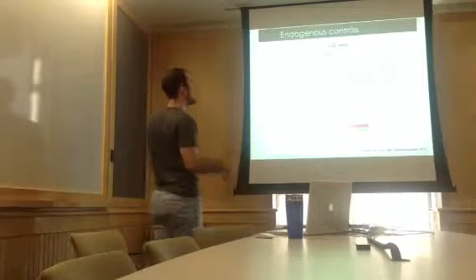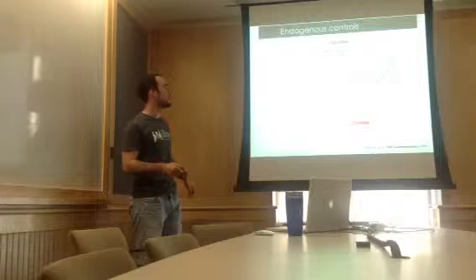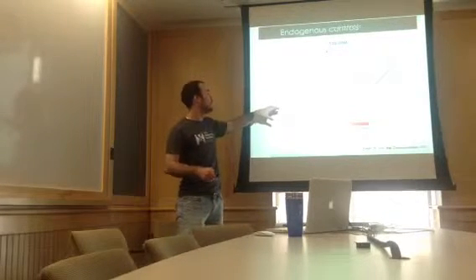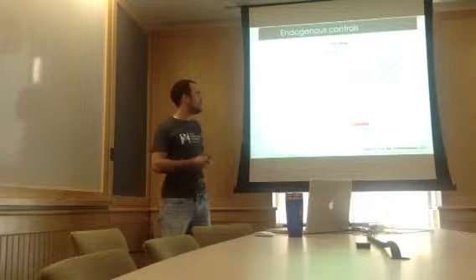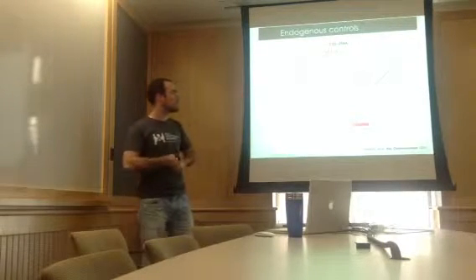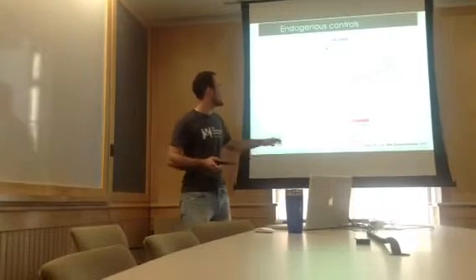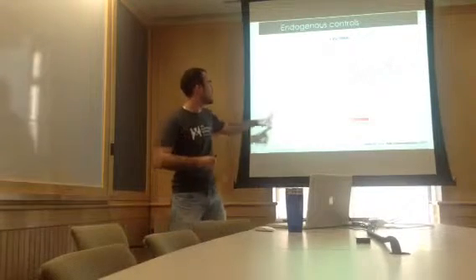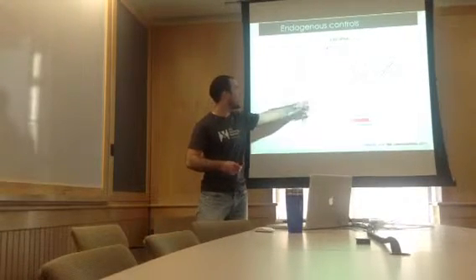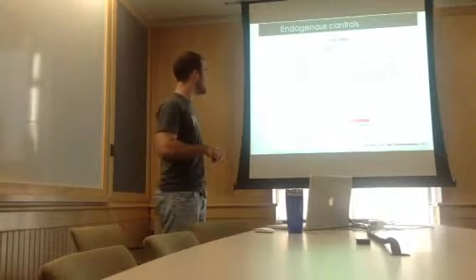And if we look at another ribosomal RNA, here the 5.8S ribosomal RNA, that is known to interact with the 25S in plants, but the 28S in mammals, and this is an interaction that is conserved throughout organisms. And here the same group that developed structure-seq probed this 5.8S in vivo, and it is the data that they obtained, in red, the nucleotides in red being more accessible in DMS in vivo.